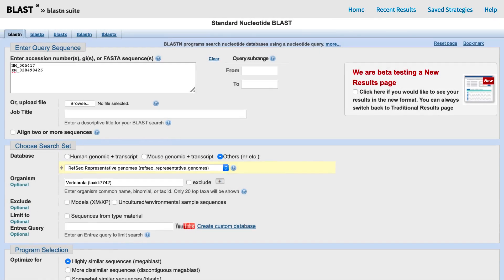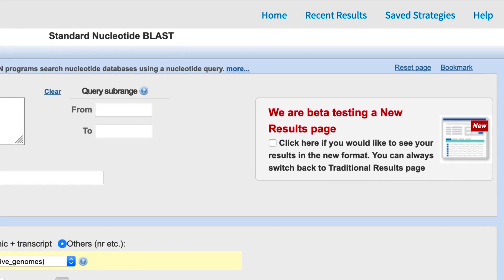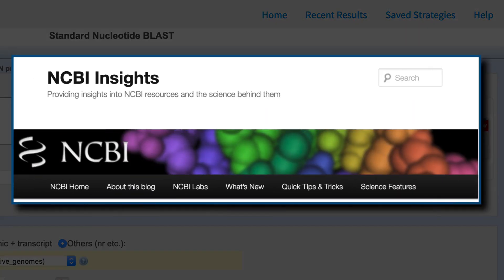We are introducing a new WebBLAST results page that is currently in beta testing. The new format is part of a BLAST Labs initiative that allows you to participate in improving BLAST. You can read more about this Labs experiment in our NCBI Insights blog.